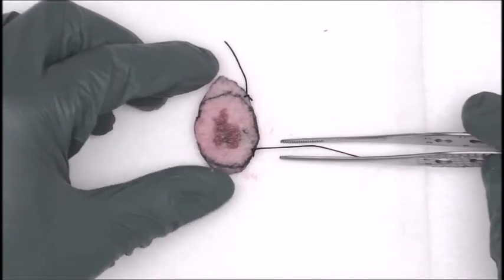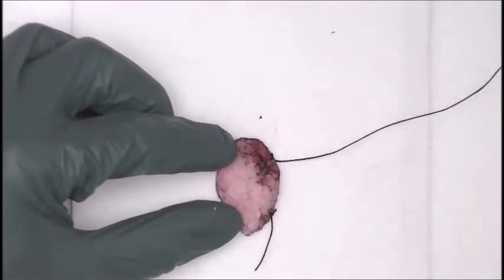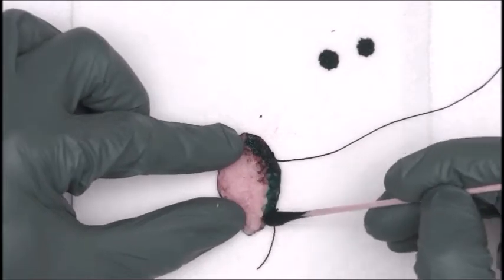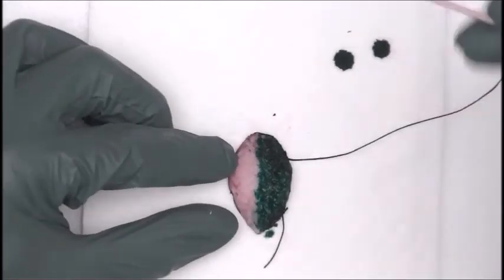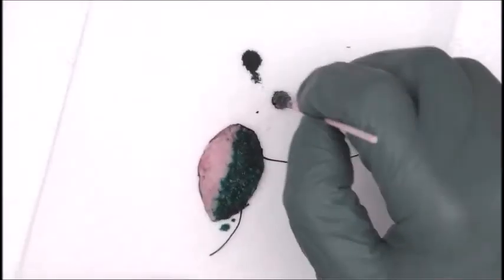Always leave the sutures on until you're done with all your inking, okay? So let's do 12 to 6 green, okay? I may have said blue a minute ago, but let's do 12 to 6 green and then 6 to 12 blue, okay?